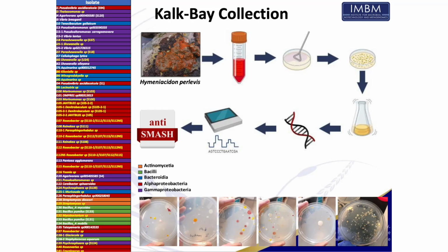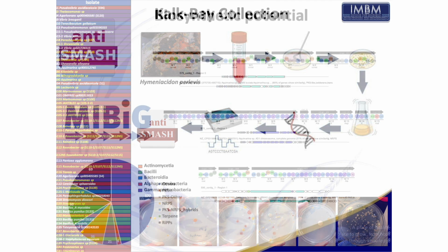The reason it's called that is we are discovering new bacteria at such a rate, people can't keep up with naming them. So the whole next generation sequencing business has been an absolute mind-blowing experience for microbiologists in particular. And down here, it doesn't show up very nicely, but just amazing morphologies that you see on a plate.